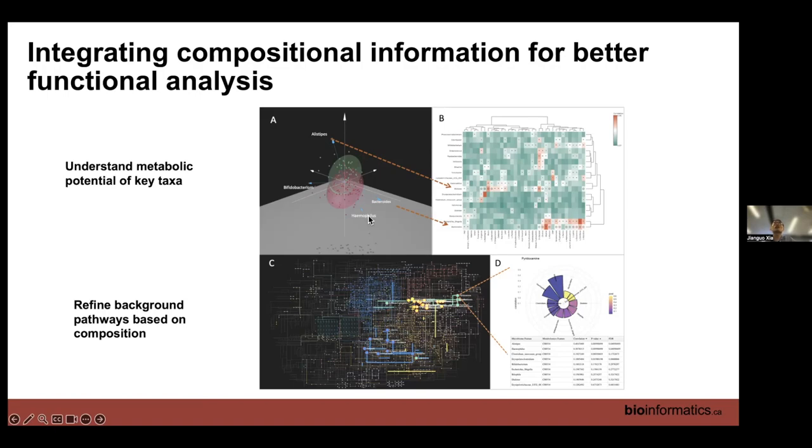So when you integrate metabolomics with this microbiome data, you get the prediction. And because you have metabolomics, you can see the consistency between the prediction and the measurement. So overall, this is quite a meaningful result.